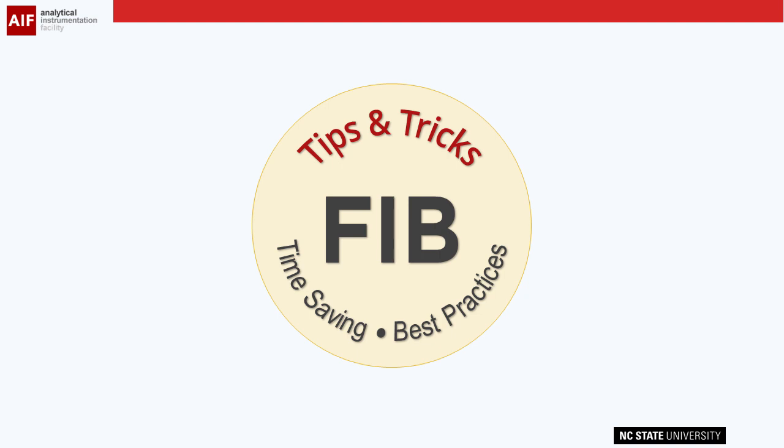During training, I show users how to use the keyboard shortcuts so that many of the actions they will need to use during their sessions are quick to access. However, I've also noticed that many users don't use them after they're trained. Use of the keyboard shortcuts will greatly elevate your efficiency and help speed up the process of making a FIB TEM specimen.